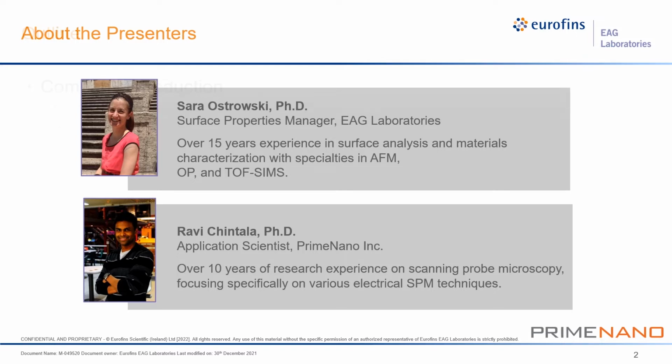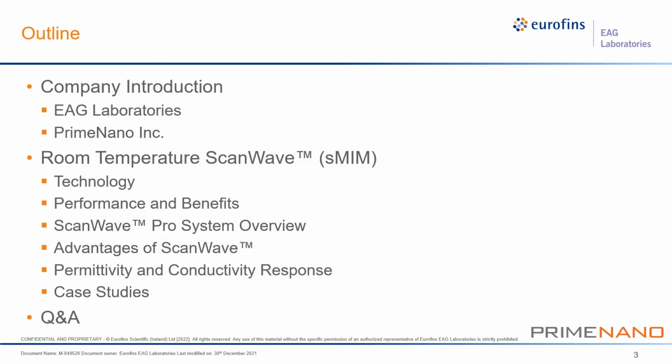Thanks, Ravi. So today's webinar is going to be divided into three broad sections. First, Ravi and I will give introductions to our respective companies. Then Ravi and his colleague Nicholas will present the technical background for sMIM and show representative case studies. Finally, we'll wrap up with a Q&A session. Our goal for this webinar is to emphasize the usefulness of this technique by showing you data from real-world examples.